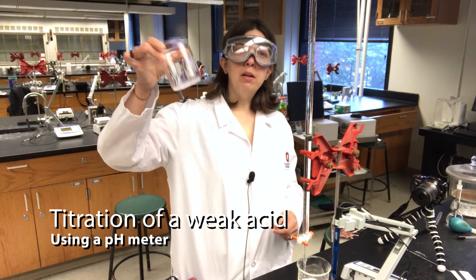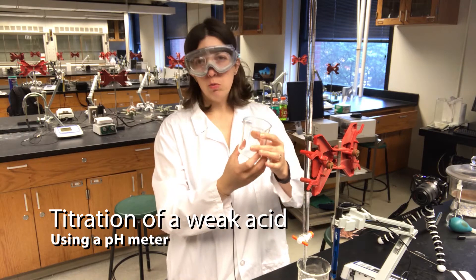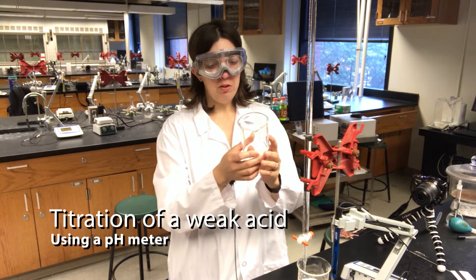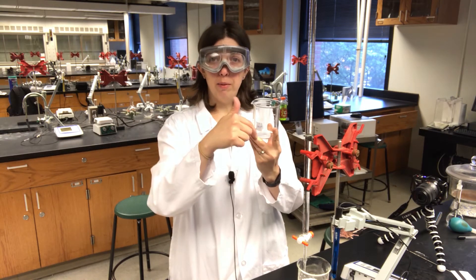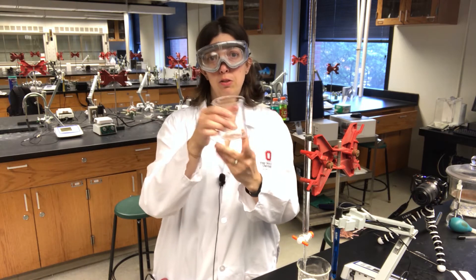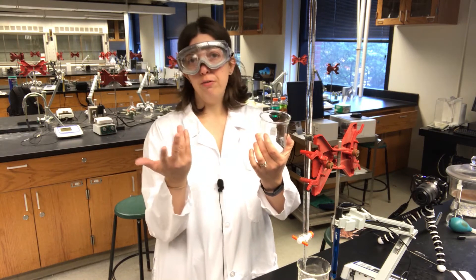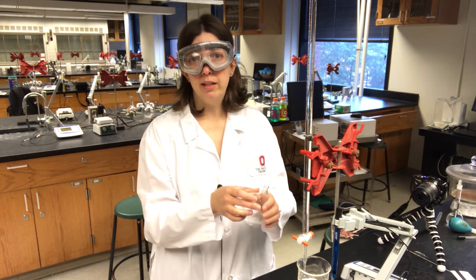I've weighed out my tartaric acid and I'm now going to dissolve it. How much water should I use? I'm going to dissolve it in enough water so that my pH electrode can be submerged completely in the solution. I'll try it with 50 milliliters first and see where that gets me.